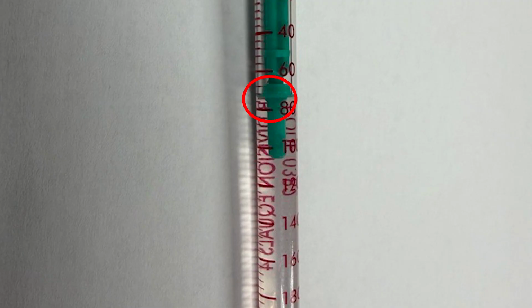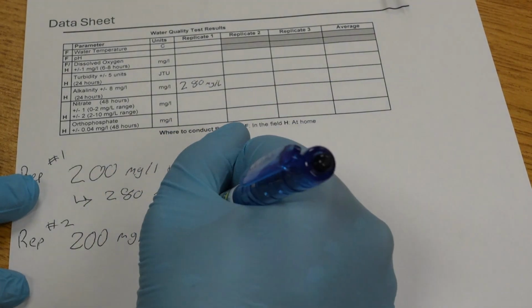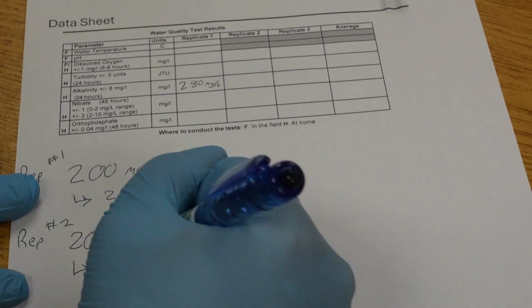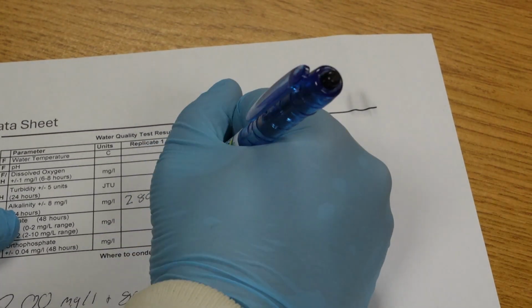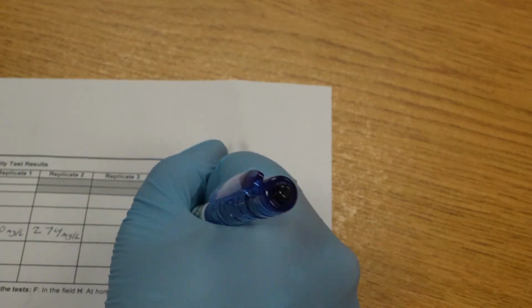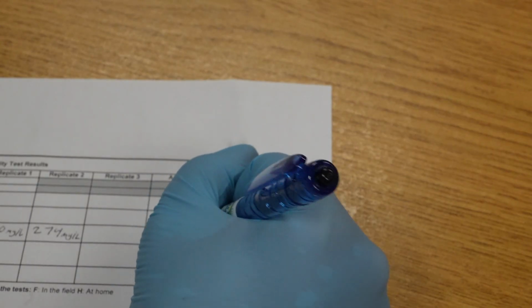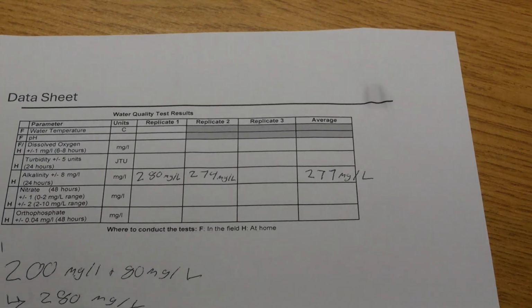Ensure that the values of the 2 replicates fall in the precision range of plus or minus 8 mg per liter with one another. If the values are outside of the range, repeat the test until 2 values are within plus or minus 8 mg per liter. Calculate the average value of the 2 replicates within the precision range of plus or minus 8 mg per liter. Round the average up to the nearest value and record it on your datasheet as milligrams per liter CaCO3.